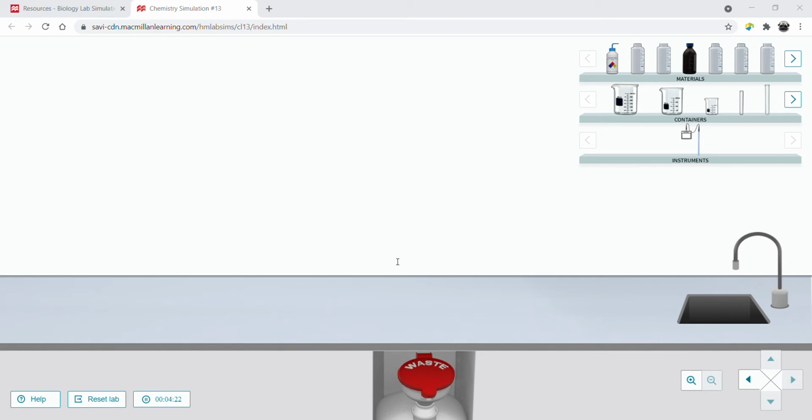Now, on page 2 of your background sheet, there are ways of measuring pH. The best way, of course, is a pH meter. We're in the 21st century, right? And pH meters have been around for quite a long time. However, there are some other ways to determine pH. There are color indicators. There are only 2 listed here, but there are many more than this.